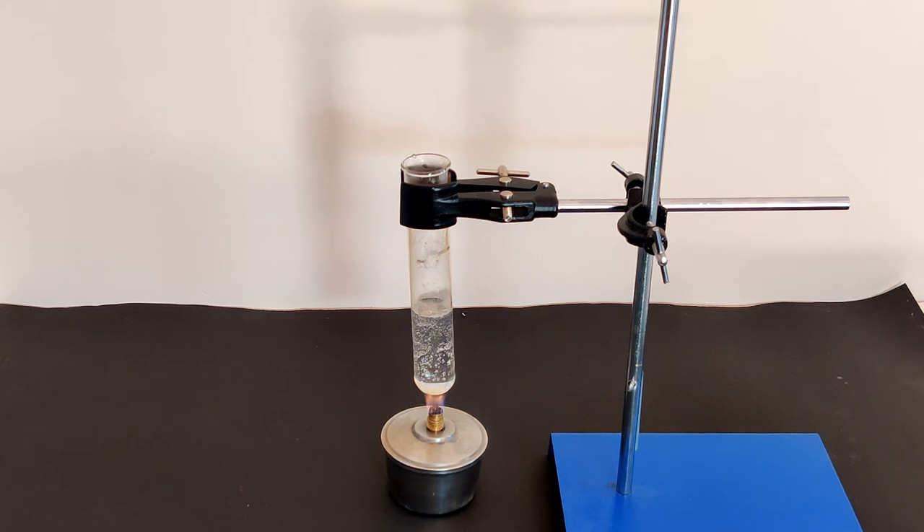Fill the test tube up to one-fourth full with water and attach it to a test tube holder. Light the spirit lamp and heat the water in the test tube till it comes to a boil and steam starts to rise from it.